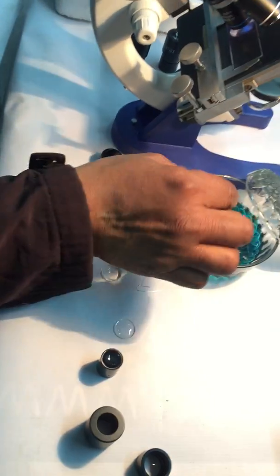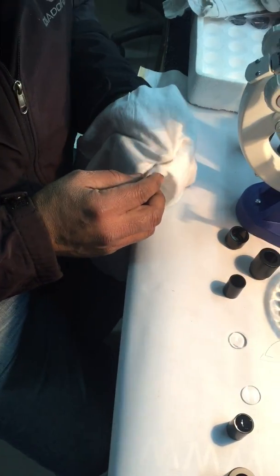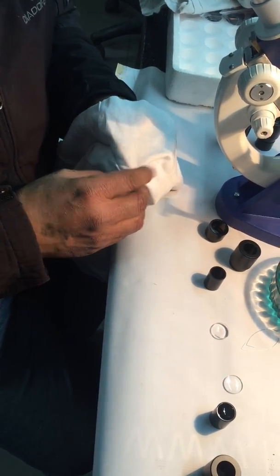First lens — eye lens. We have dipped it in spirit, and we will just rub it properly with a clean cloth. Is that a cotton cloth? Yes, cotton cloth.